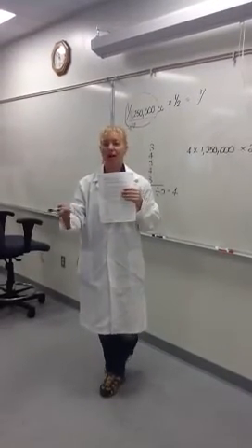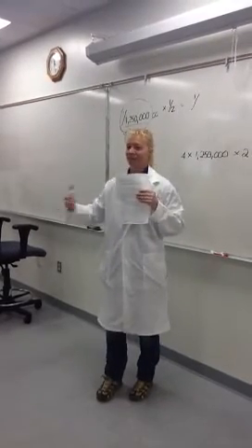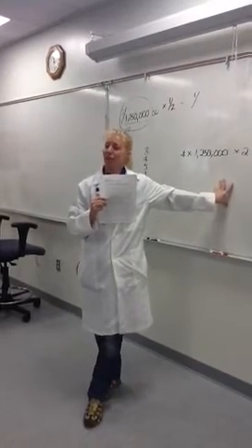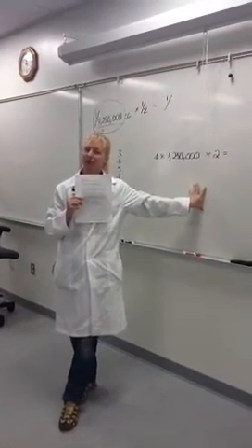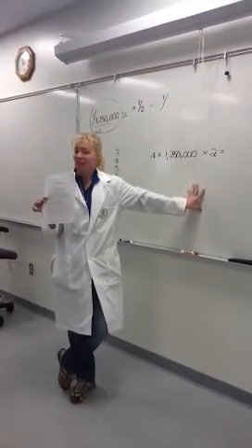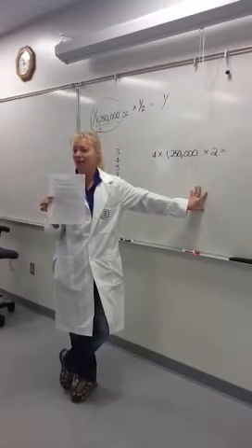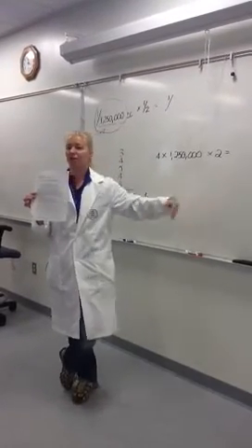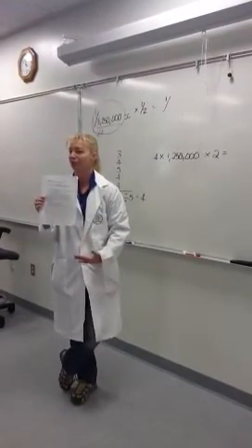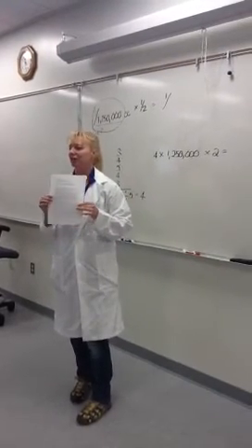So if they are rapidly dividing and they're in ideal conditions, 2 hours later, the number you have doesn't really matter anymore, because now you've got even more of them. They've grown in there. It's a cheap way of doing this technique, but that's one of the advantages to the electronic techniques that are automated, is when you look in there and you're either using the Coulter counter or you're doing it based on how much light penetrates through, you get the results immediately before that number is changed significantly.